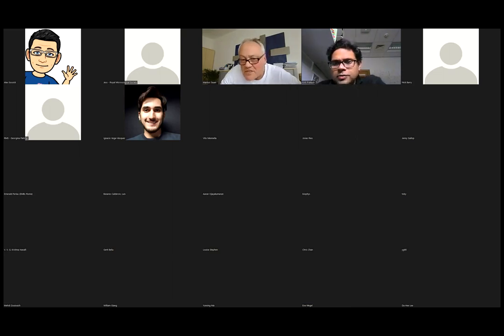How much time can the sample be imaged by dSTORM with the imaging buffer used? In these re-embedded samples, we use the standard photoswitching buffer with 100 millimolar thiol, and there is no large difference in the imaging time. This photoswitching buffer stabilizes the whole behavior dramatically, we have to say. But it's, of course, an additional step, this re-embedding in non-charged polyacrylamide gel. And well, it also shrinks your gel a little bit, 10, 20, 30%, depending on the conditions.